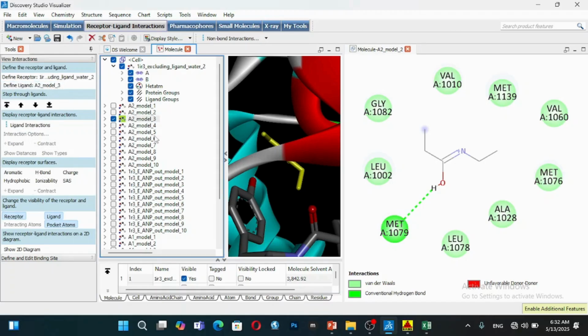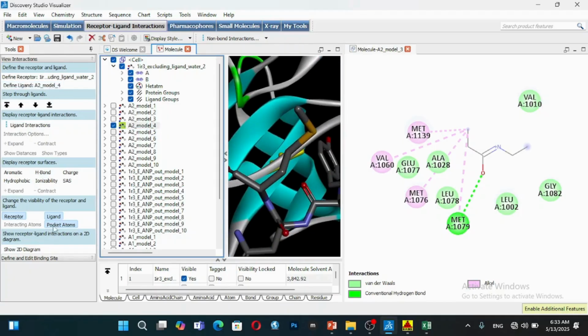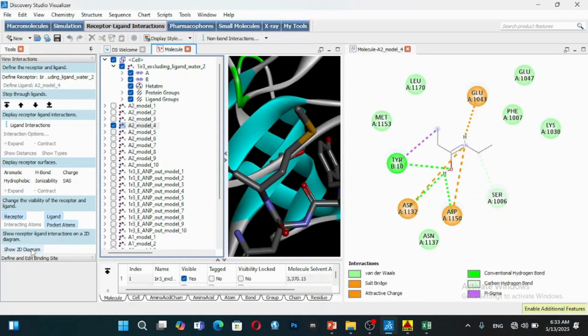So let me see. Okay, that's correct. Now, so we can keep changing this. Let's use model 4, and then okay, good.